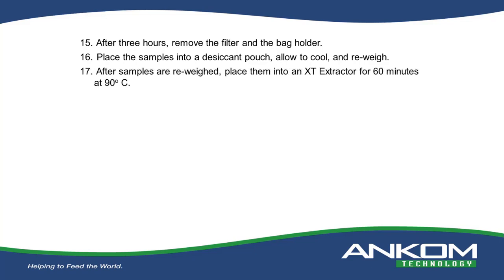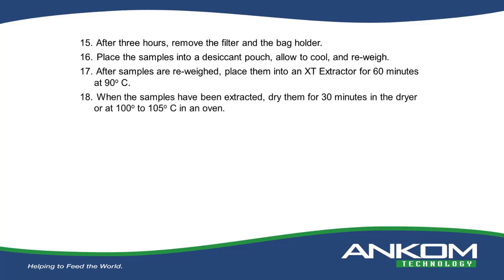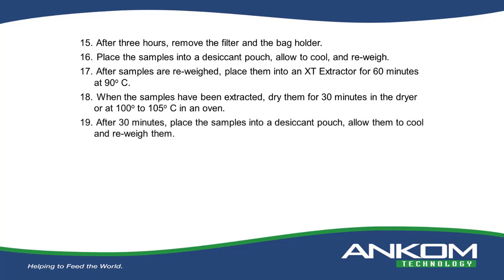When reweighed, place the samples into an XT extractor for 60 minutes at 90 degrees C. When the samples have been extracted, dry them for 30 minutes in the dryer or at 100 to 105 degrees in an oven. After 30 minutes, place the samples into a desiccant pouch, allow them to cool, and reweigh them.